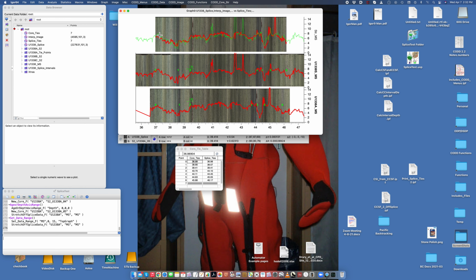All right, getting pretty close. These guys line up, those guys line up, those guys line up. These white things line up. That lines up, that lines up, that lines up. So I think that probably looks pretty good. You know, you might add a point out at the end here and here if you want to stretch it out a little bit, but it's not absolutely necessary.